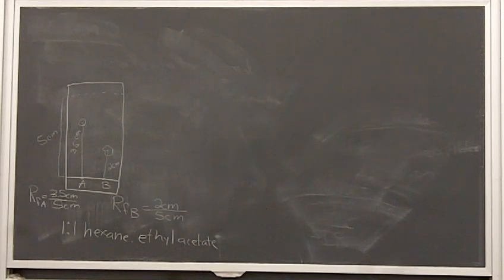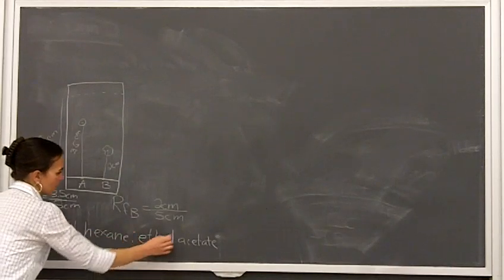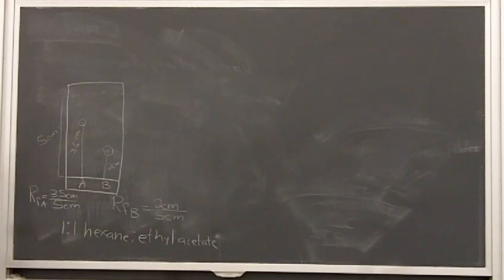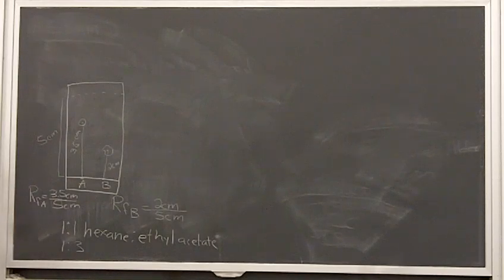You want your compounds to hang out more with the eluent. Which of these two is the more polar solvent, hexane or ethyl acetate? Ethyl acetate is more polar than hexane, right? So you would want to do something like 1:3 hexane ethyl acetate. That'll make those spots travel farther up the plate, have greater RF values.